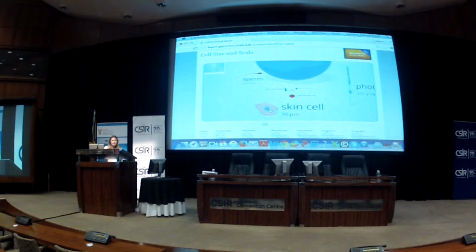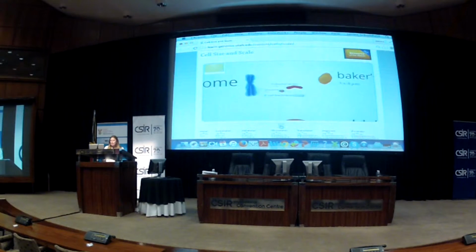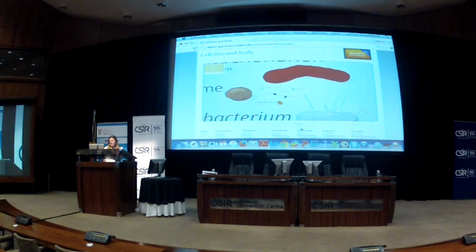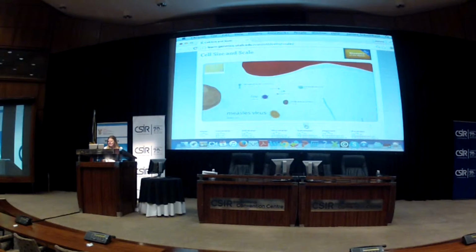But we're interested in seeing what's actually going on inside. We want to understand that terrain better, so we need to understand the machinery better, so we need to get closer. If you are lucky and you've got some pretty rad microscopes, you can start getting, there's your bacteria, which are fairly easy, and there's your virus, well, a rather large one. A confocal microscope will get you to visualizing these, to resolve these at an almost individual level.